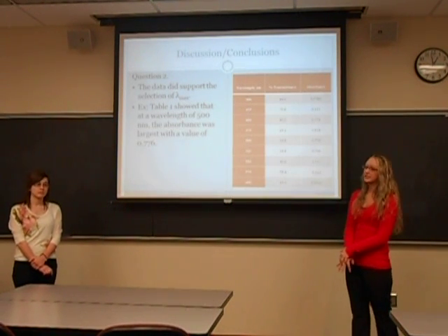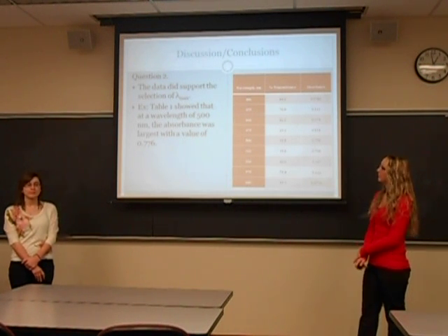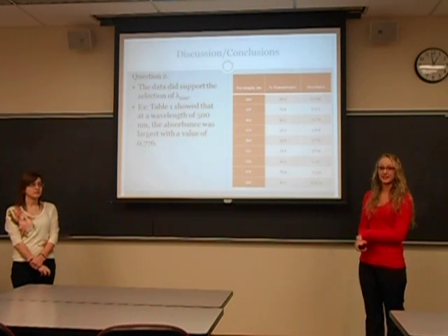This is question 2. The data, in fact, did support our selection of lambda max. Our example is in table 1. It showed that at a wavelength of 500 nanometers, the value of absorbance was the largest with 0.776.